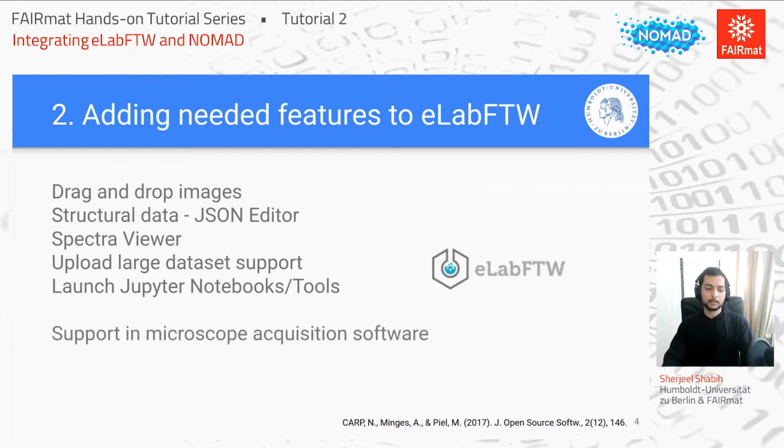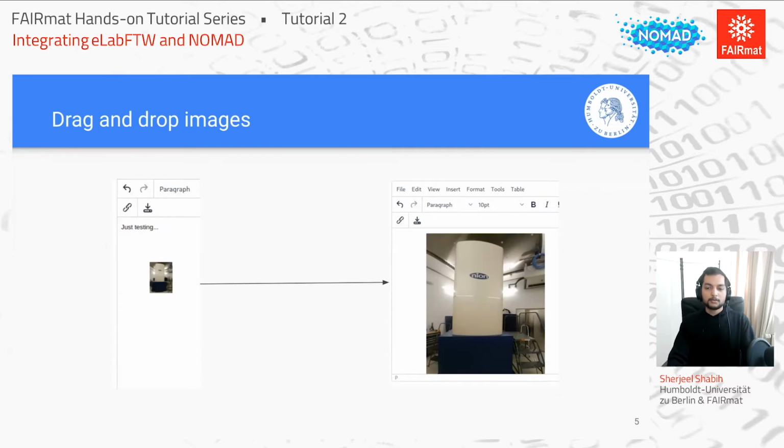On top of that, in the talks yesterday, we mentioned that we added support for eLabFTW in our acquisition software. This was also done through the API. So whenever we collect data at our microscope, we can upload that data directly to eLabFTW with a single click. But I will not demonstrate that today. I don't have it installed on my system, but we do use it in our lab, and it works rather well.